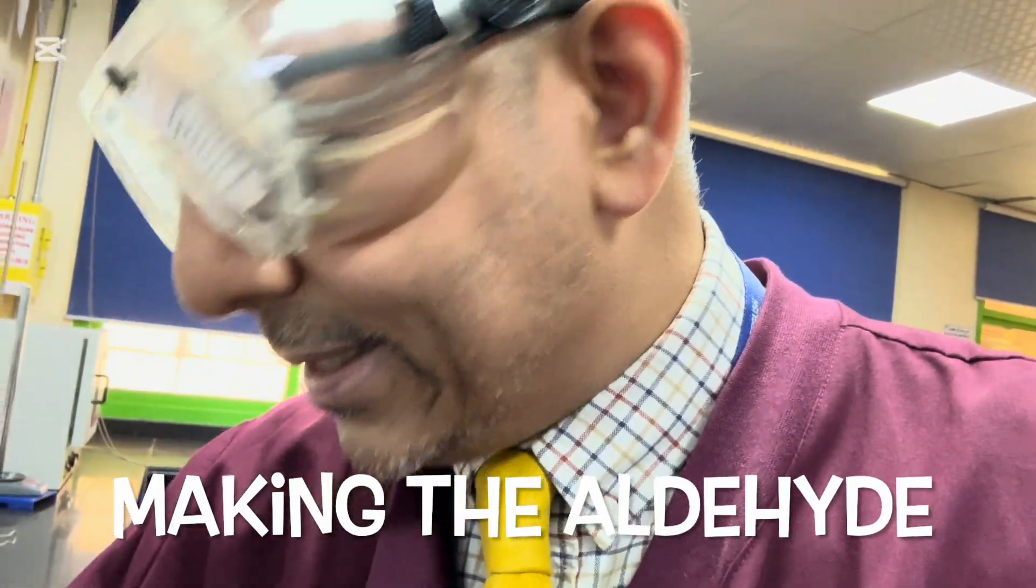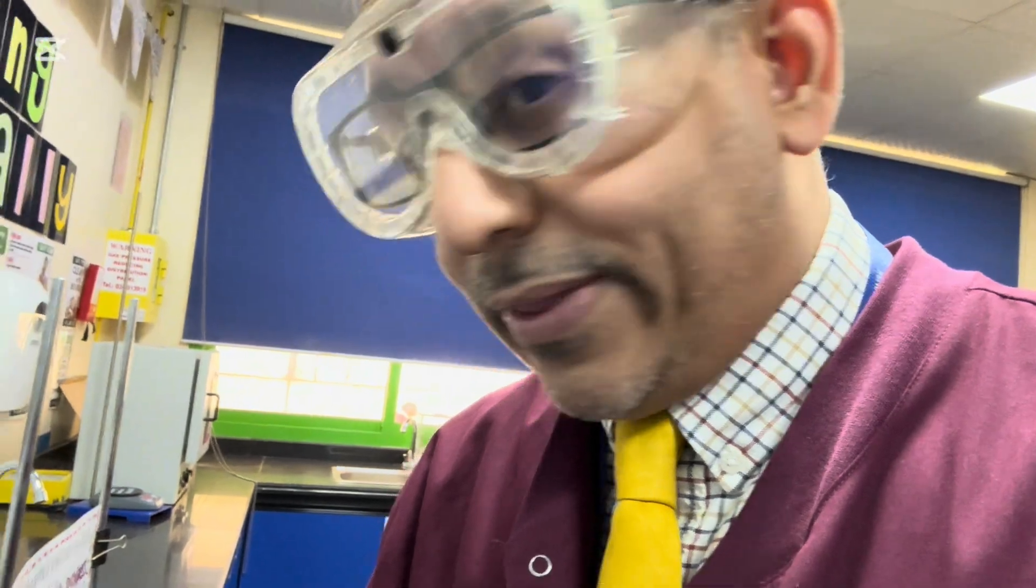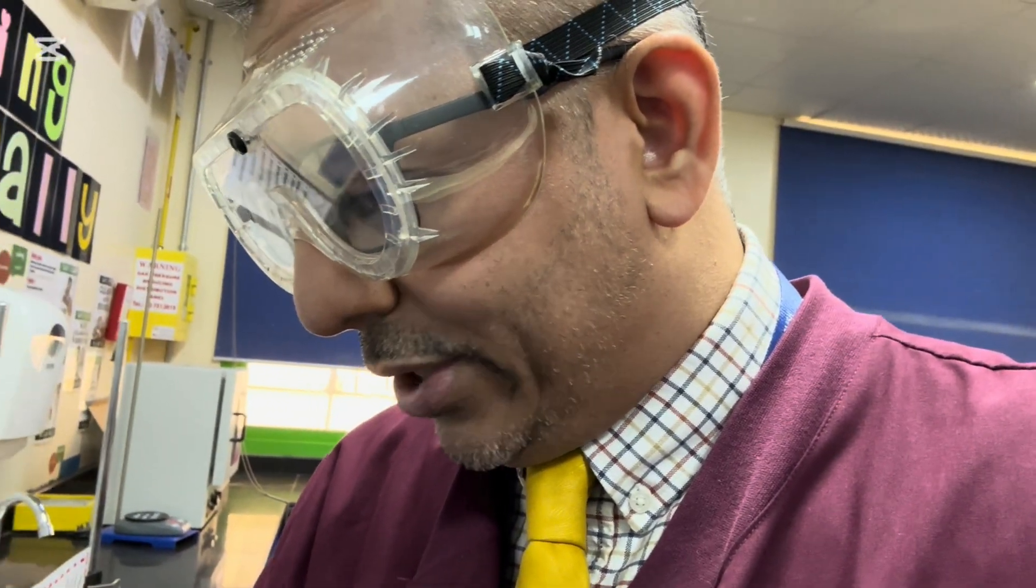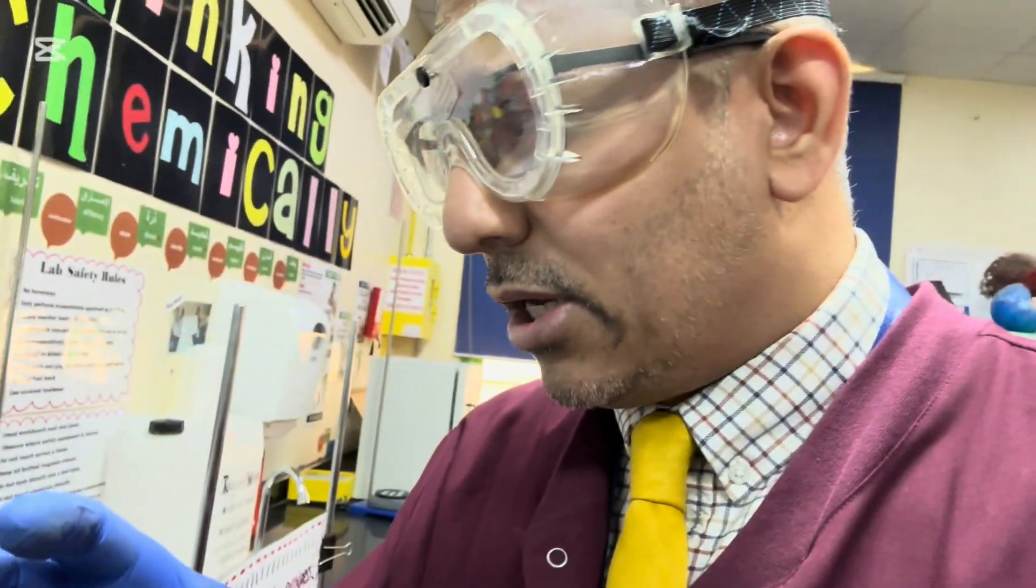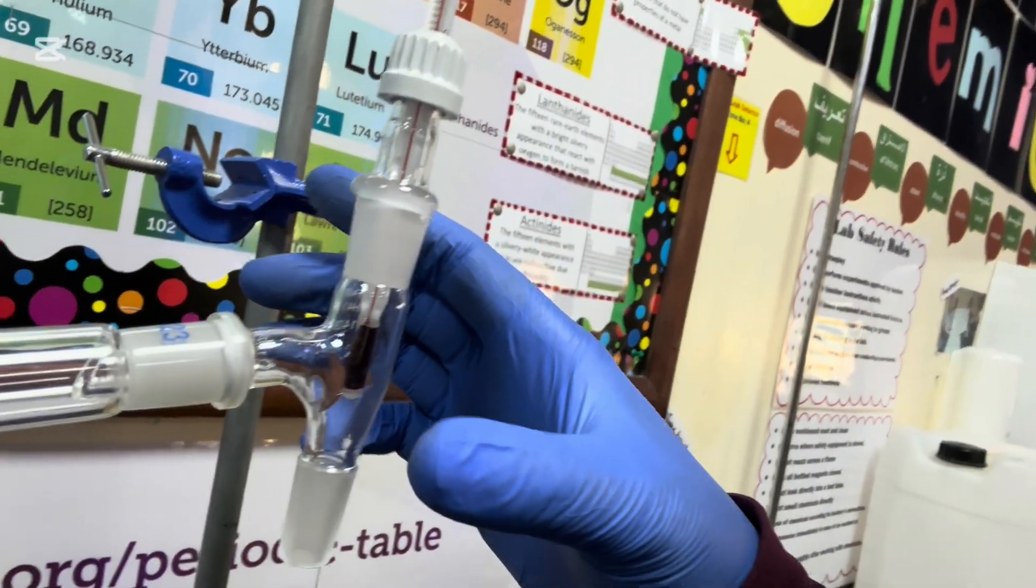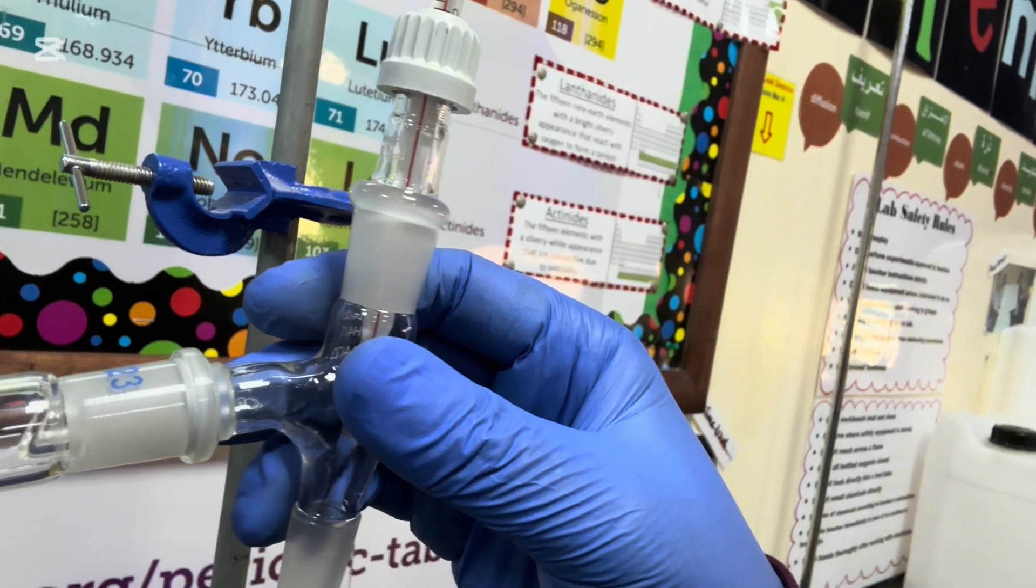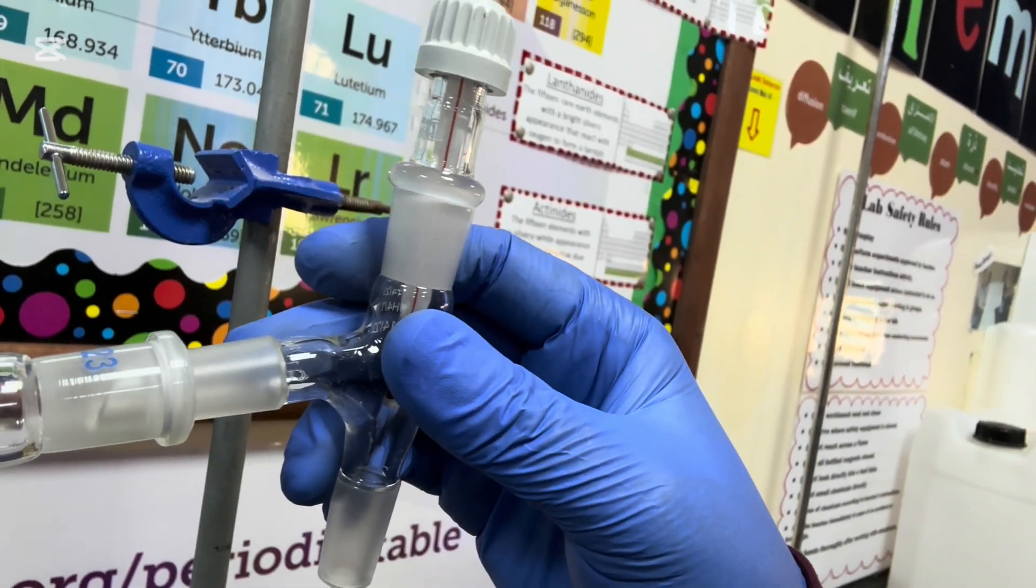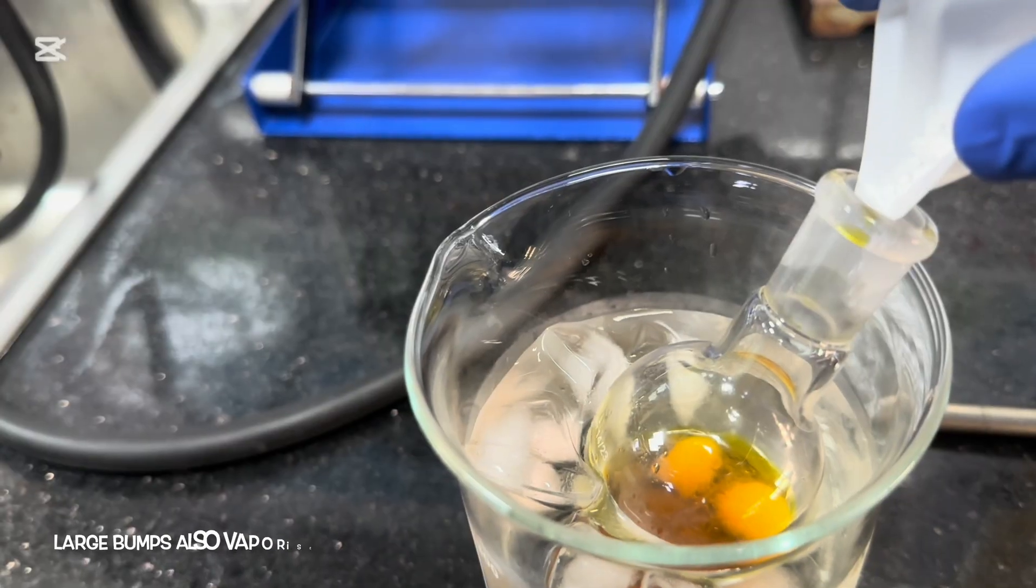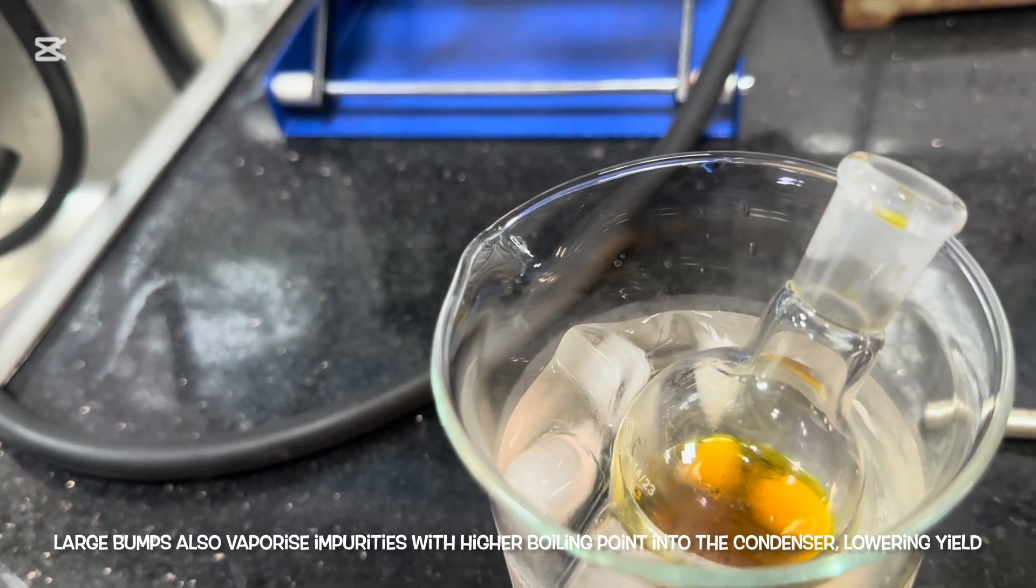I'm going to now add some anti-bumping granules. If I was to try and attempt the distillation without the anti-bumping granules, then what would happen would be that you would get large bubbles forming, and the entire distillation apparatus would just shudder. So if you have large shudders, these can become quite loose, and if they become loose, any vapors that you have traveling through the apparatus could escape and you lose your product. So these are inert. They don't react with any of the reactants that we're going to be using today.